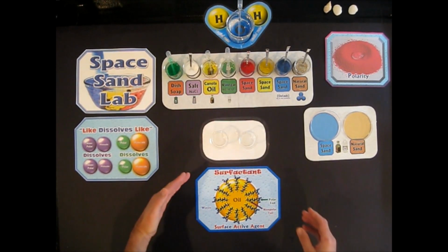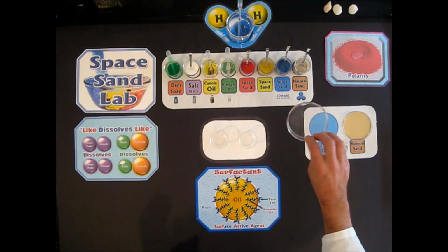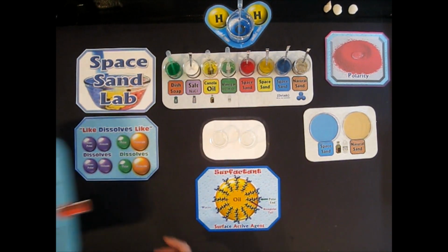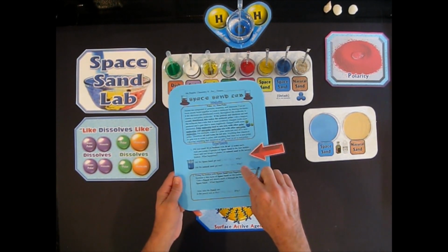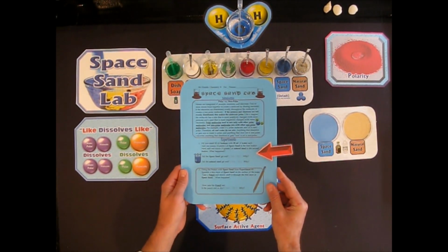I'm going to take it from a different angle, and do a couple of experiments in the Petri dish. We don't usually use these in chemistry. So we're going to go through and do the experiments, and you can write them all down. Write down anything you observe, and then you'll be able to complete the lab from this video.